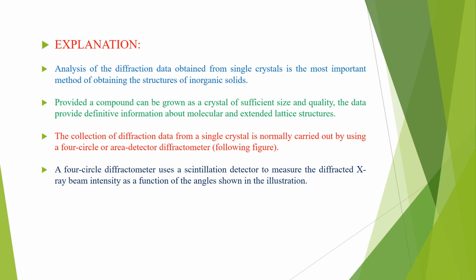The data provide definitive information about molecular and extended lattice structure. That means, for collecting this definitive information from the crystal, we have to grow a crystal of sufficient size and quality.